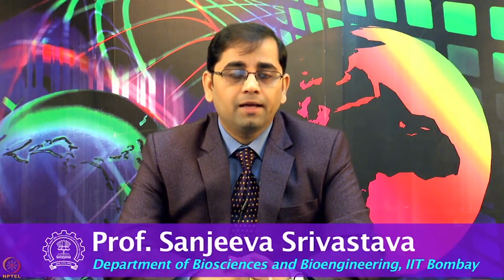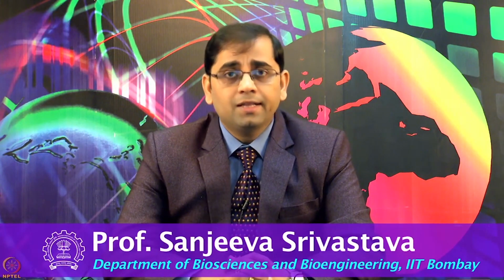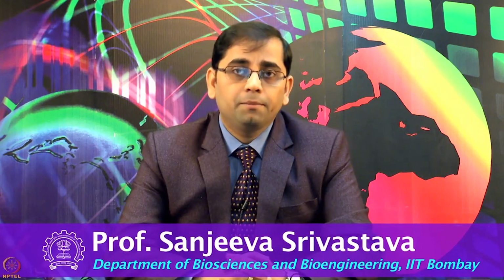Welcome to MOOC course on applications of interactomics using genomics and proteomics technologies. We are discussing different microarray based platforms and how to perform some biological applications on these chips. In the last lecture, Ms. Apurva Venkatesh showed you how to perform a microarray experiment using serum samples obtained from patients who are suffering from falciparum or vivax malaria.